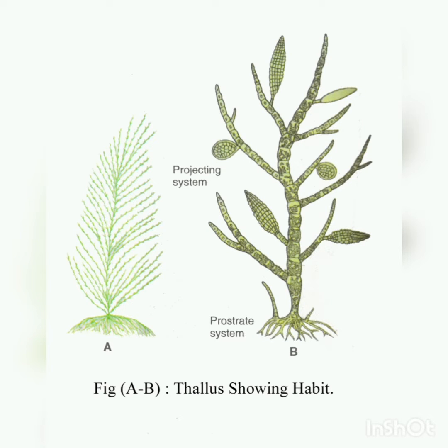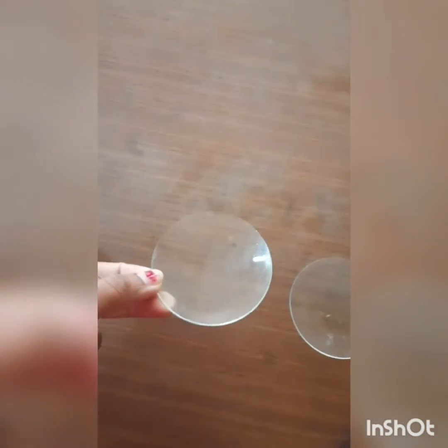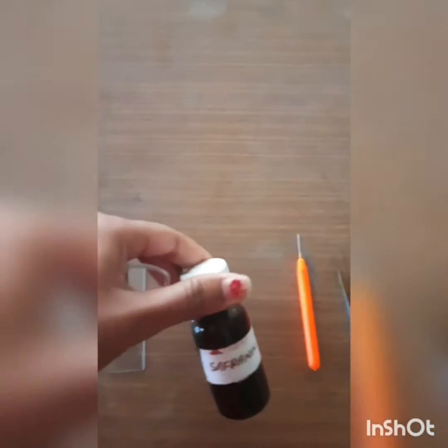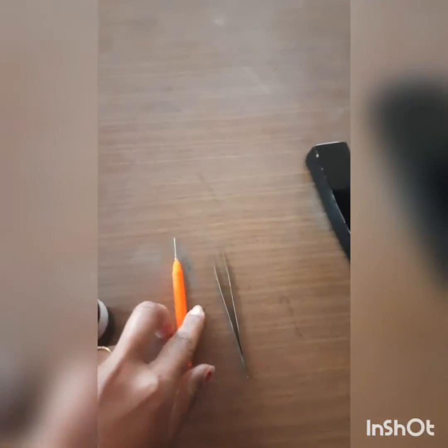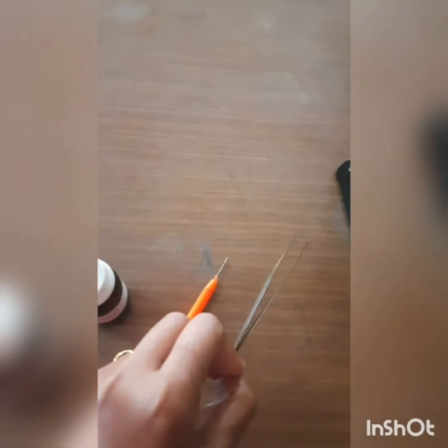Hello students. In today's video I am going to demonstrate how to prepare a temporary slide of Ectocarpus plurilocular sporangia. Requirements: Ectocarpus plurilocular sporangia sample, watch glass, clean glass slide, saffranin stain, needle, forcep, and compound microscope or light microscope.